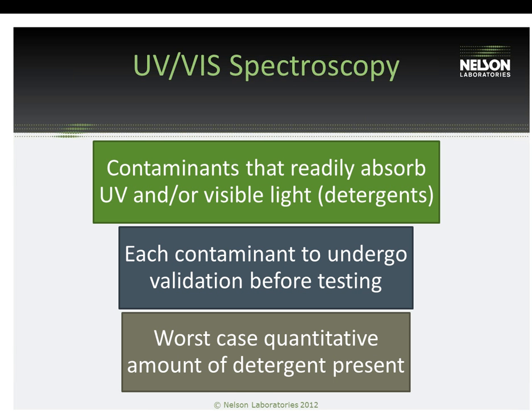With these detergents, some detergents can have a very, very specific peak shape. And so we say, like TOC, that this test doesn't really have a lot of specificity and it's a worst-case amount of detergent left behind. However, if you're getting a very, very similar curve to your detergent when it's compared to the residue, you can have some specificity there to show that what I'm quantifying is actually the detergent. So this test option is a great one if you are specifically wanting to look at a detergent used in your process and how well that's being removed after you clean your device.